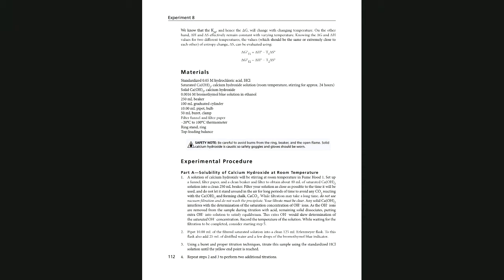I'm going to follow the procedure, and as usual, I'm using my lab manual, so I'm going to stop sharing the document with you, and I will share the camera for you to watch me performing the experiment. Record your data as we are moving.